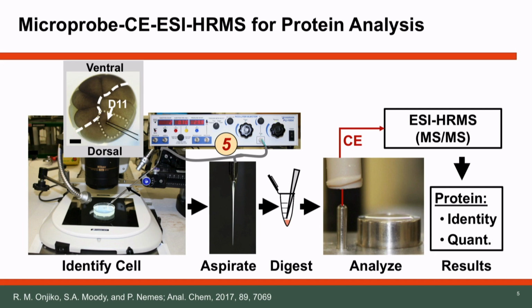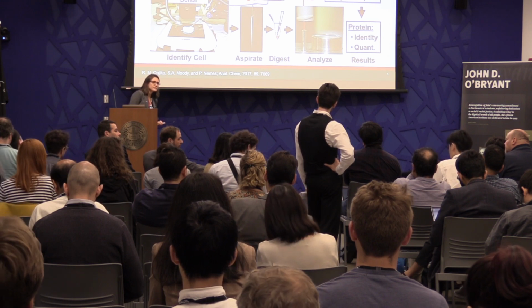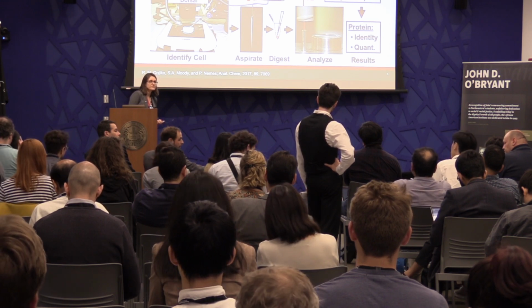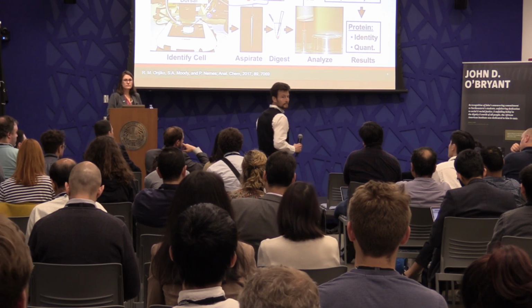Well, in my experience, it just gets harder because of the negative pressure. Because when you take out the capillary from inside of the cells, the liquid from the environment also flows in. So what you can do with the system is that you have an option that is called balance pressure, and so you can set up that balance pressure so that you actually don't have the liquid drawn into your needle.